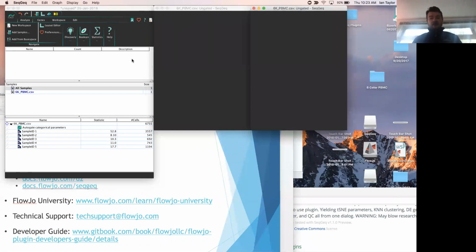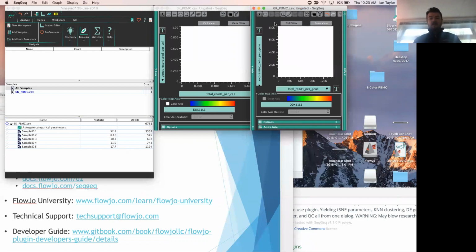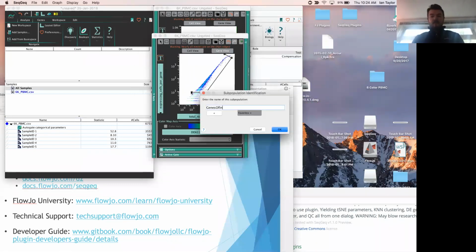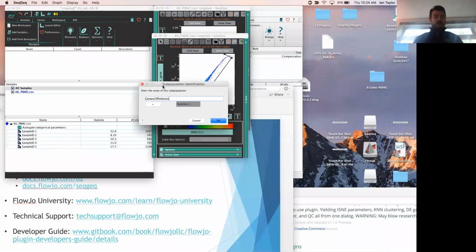And here I'm going to gate just sort of almost a singlets gate, starting at a value of 10. Moving all the way up here, I'll leave out those last few highly expressed genes, and we'll call this genes of interest. This gives me something to run Seurat on, so I'm not running on the entire data matrix, which again may take quite a while.